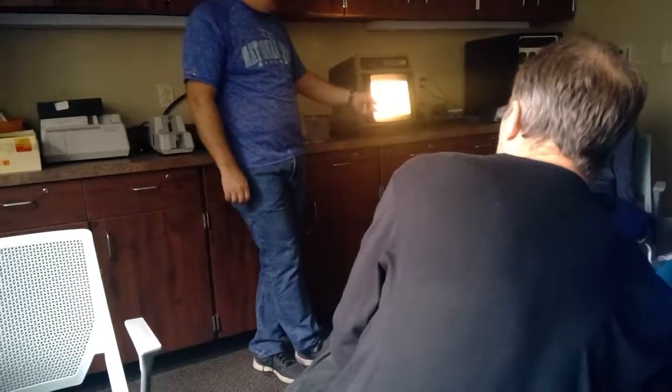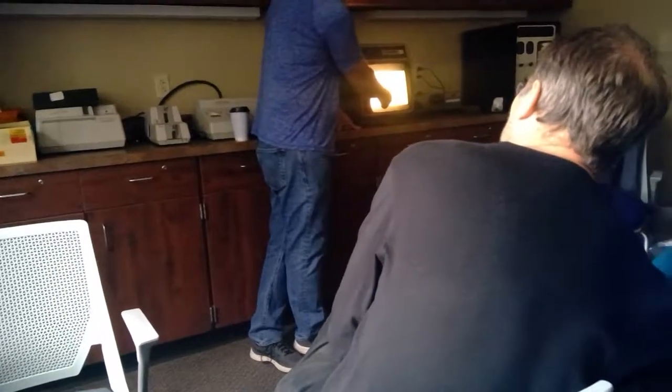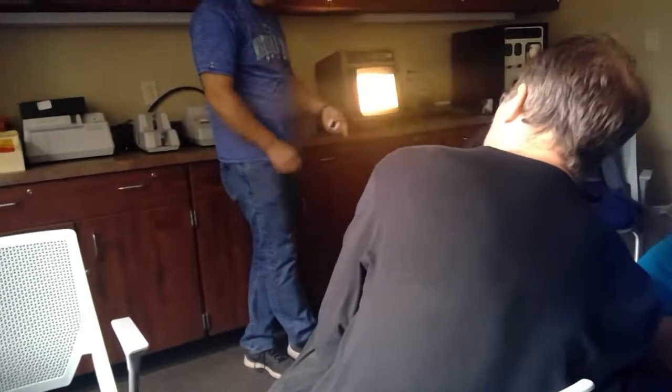All right, this is a pretty good slide here. Pictures of all the additives and stuff. The water? No, it's just so hypotonic that it's going to try to break. It's a fat body, but it also has things in it. This is not a renal tubular epithelial cell. This is a fatty cast. This is a cast that has a lot of lipid content that's sticking to it. So naturally, if you put it in the polarizer, you've got the cast there, and look at all the little Maltese crosses. Okay, so this would be a fatty cast, and that's it under polarization.